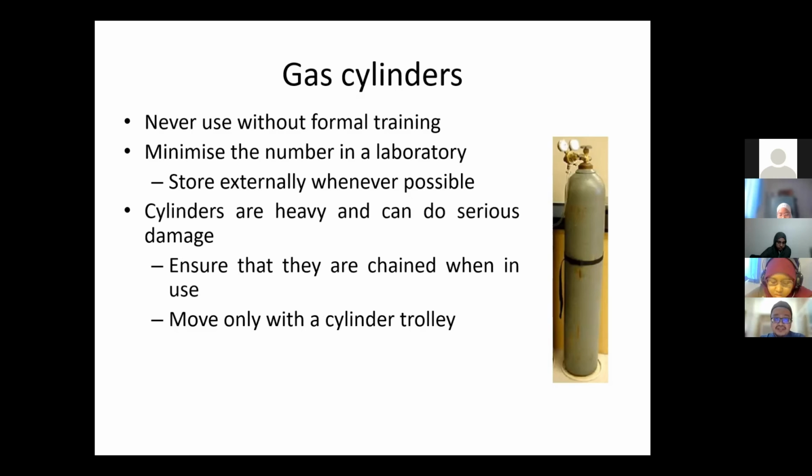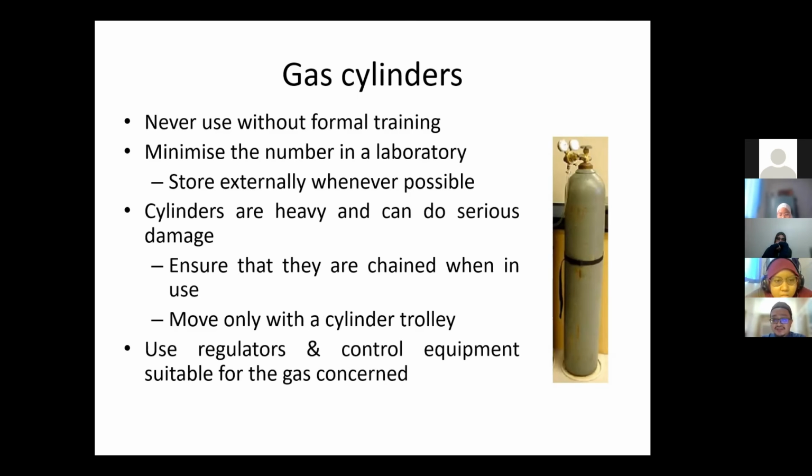So cylinders are heavy and can do serious damage. They must be chained when in use, and when we want to move them with cylinder trolley. I'm telling you now because you will be the supervisors in the future. Yeah. So benda simple, but you have to be told. Use regulators and control equipment suitable for the gas concern, and consider the consequences if cylinder leaks.